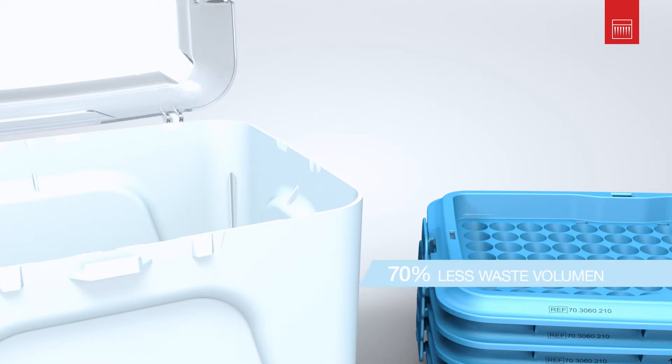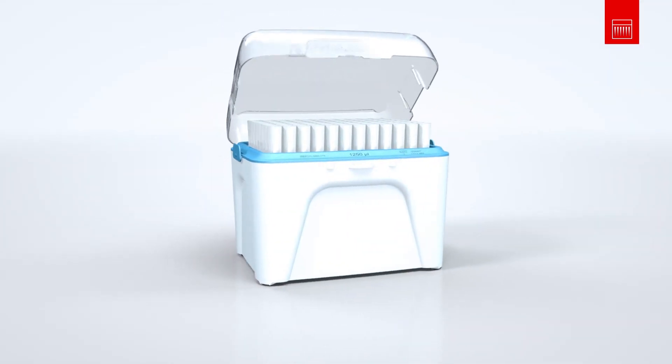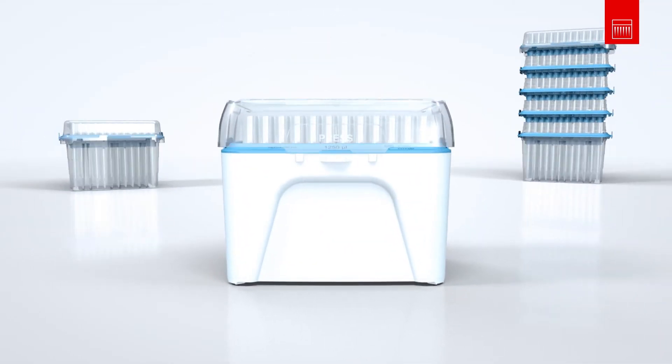This reduces the waste volume by up to 70%. Central, reliable and convenient — the universal workstation.